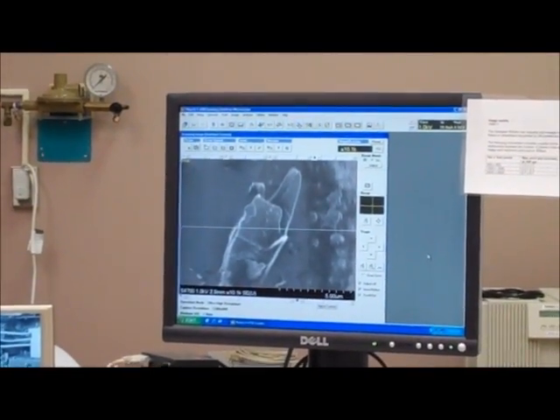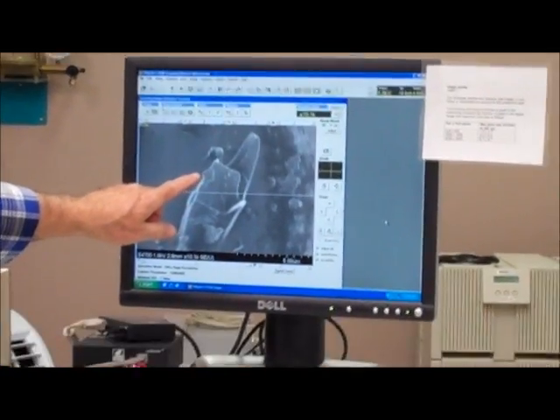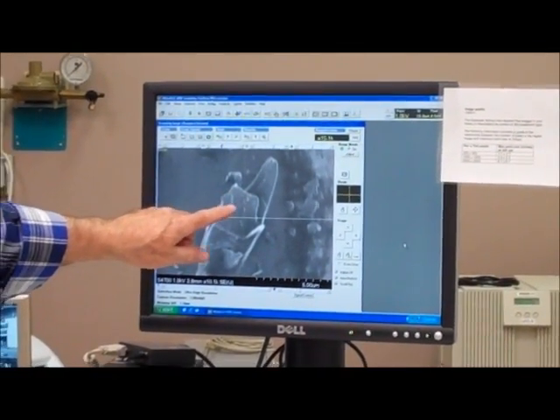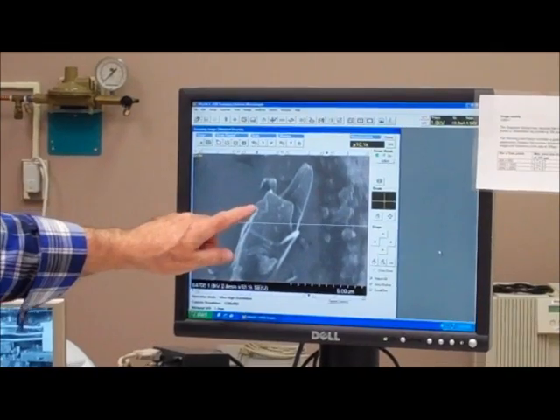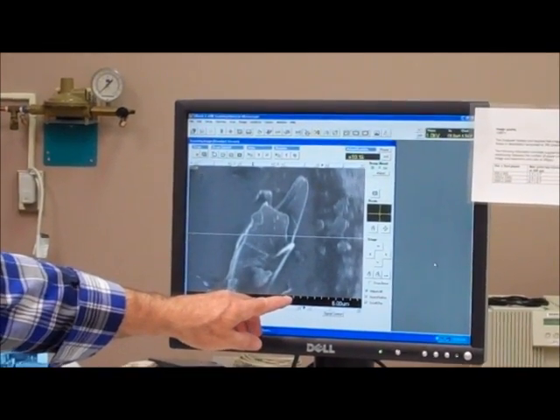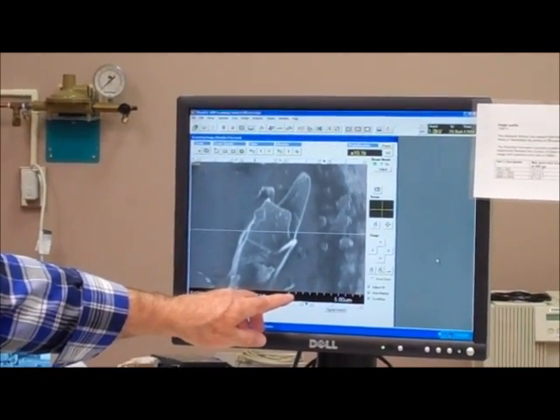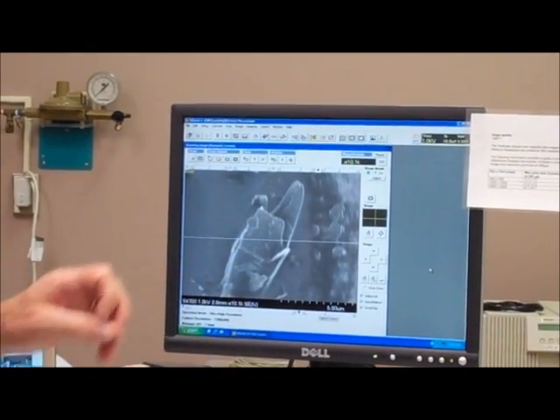So then if you look, for instance, at this feature right here, this little square piece, is about 50, about 50 nanometers.